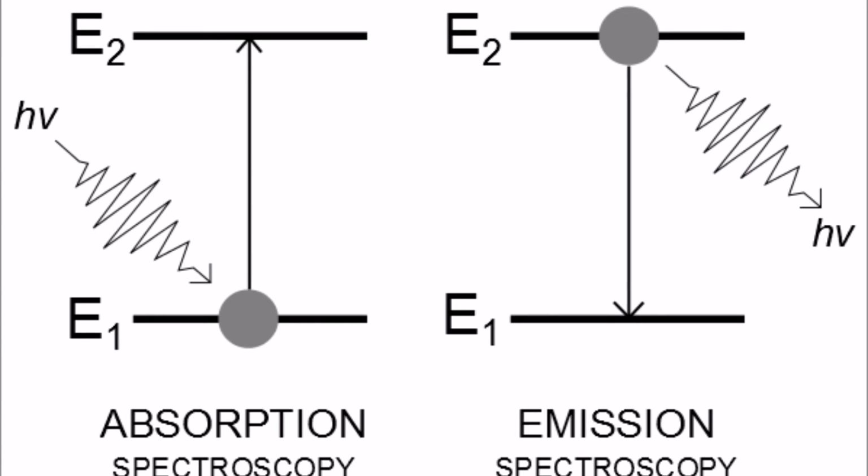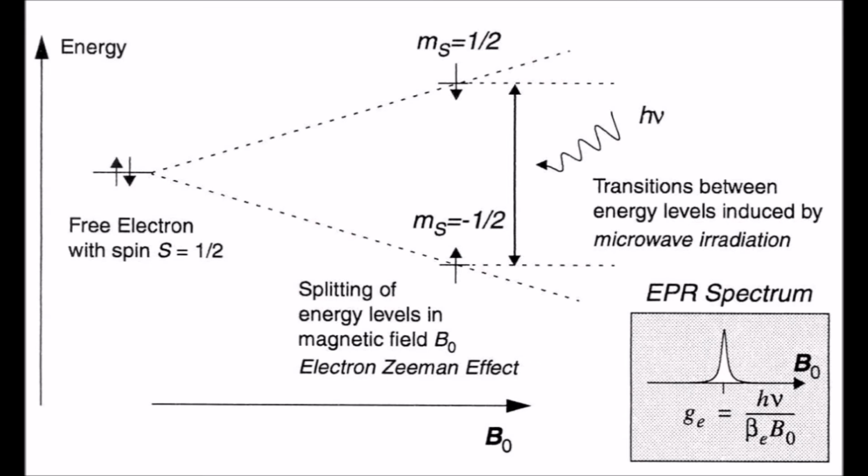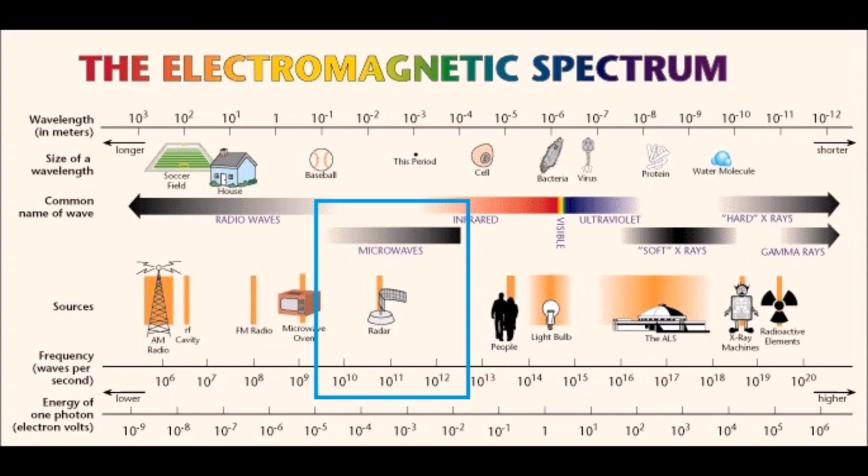In the presence of the applied magnetic field, unpaired electrons can move between two energy levels by either absorbing or emitting a photon of energy hν, such that this photon energy is equal to the difference in energy states between the two unpaired electrons, which leads to the fundamental equation. With ESR, we are able to give information on materials that are in liquid and solid phases. In addition to the magnetic field, the ESR produces electromagnetic frequencies, usually in the microwave range of frequencies.